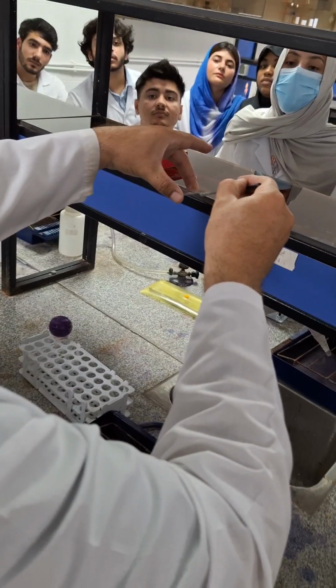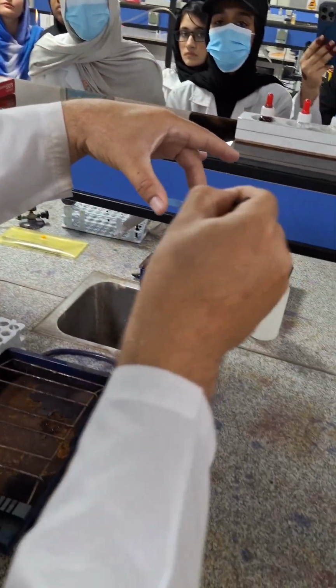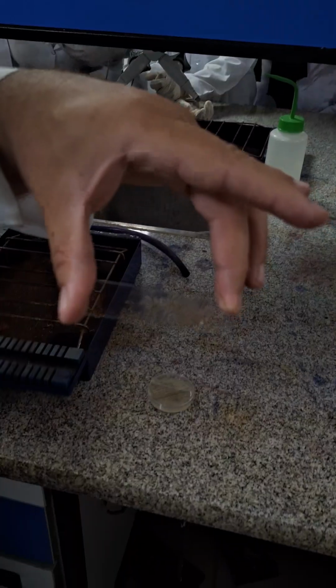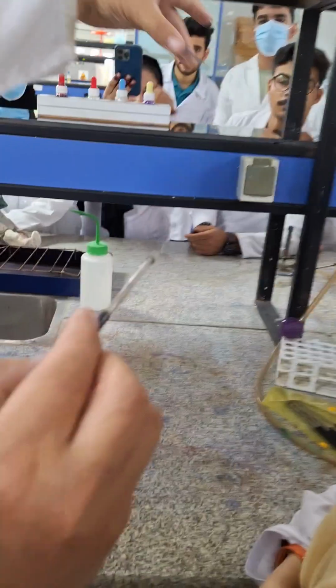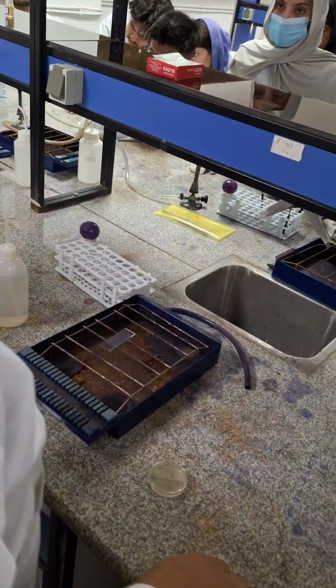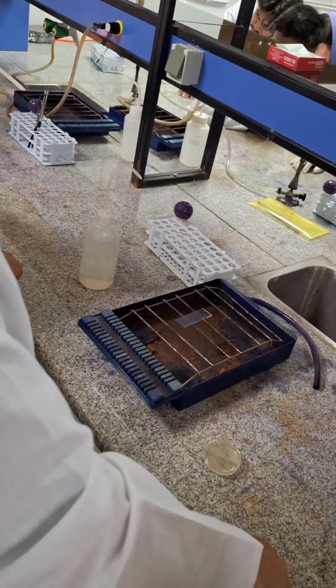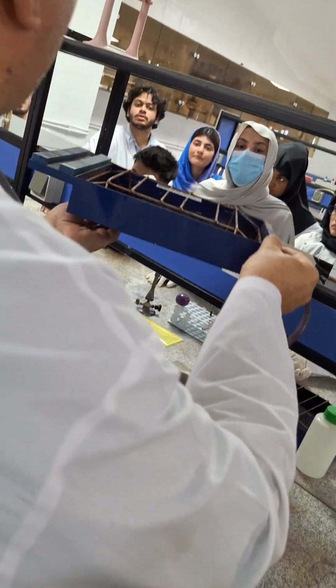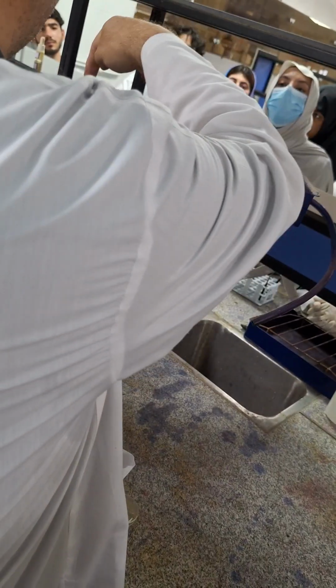Look here, like this, from the center to around. Place your slide on this staining tray, not here, here, and let it air dry.